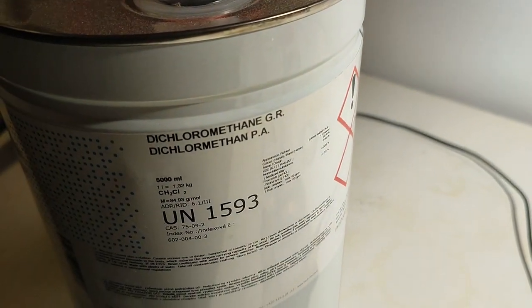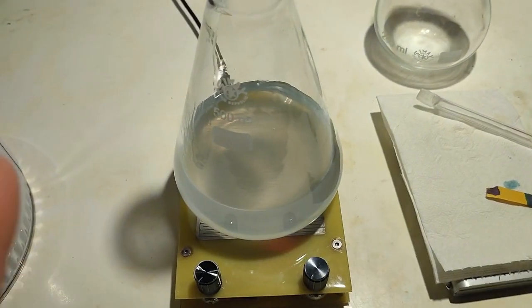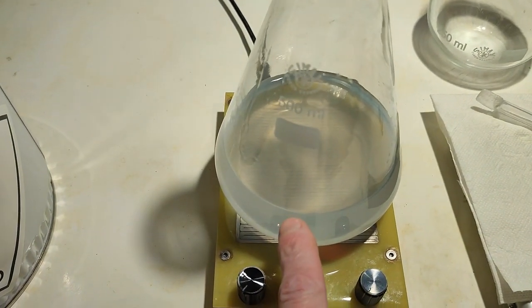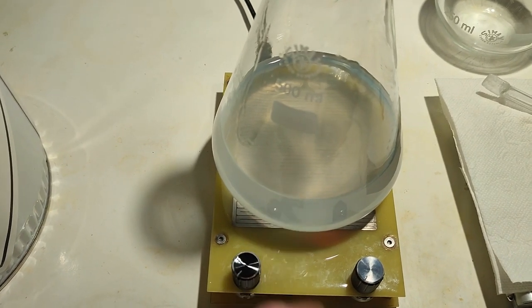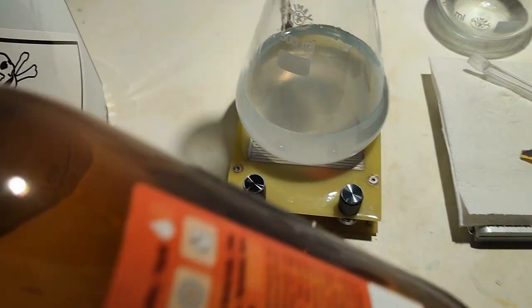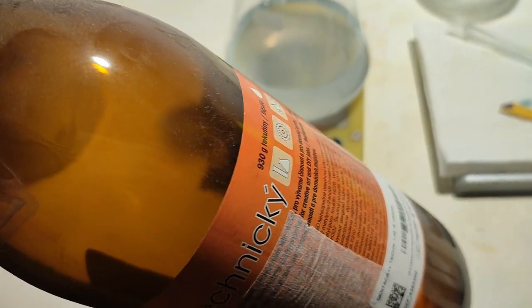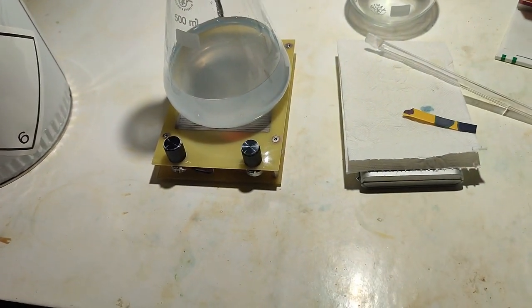And look at this thing, I also have DCM now, yay! Having said that, I'm going to extract any organics there are in here, and then methacrylic acid. So yeah, I can probably store this DCM in here. Sounds like a plan. Okay.